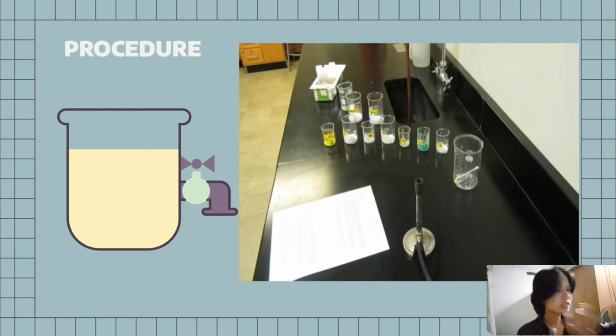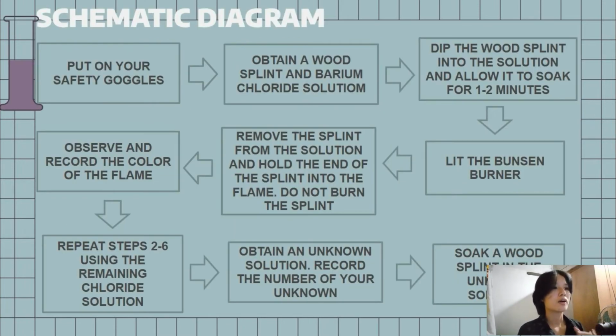And yeah, so let's move on to the schematic diagram of our procedure for performing our flame test. So, first of all, safety is always first.